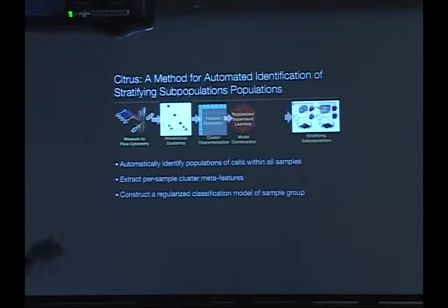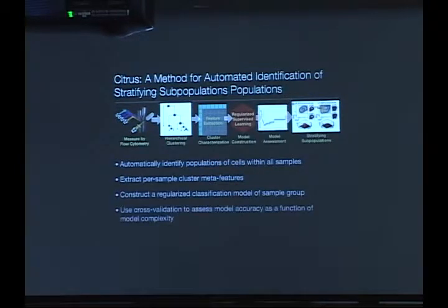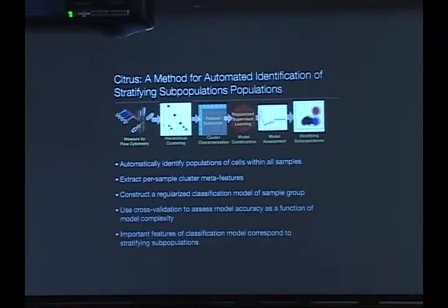It'll say, you gave me 100 cell subsets. I'm telling you that these two are the ones whose abundance differs between your healthy and diseased patients. And so we can evaluate this model using some cross-validation techniques. But really what it comes down to is if the model can find something that's strongly associated with your endpoint of interest, those are in fact the cell subsets that you're interested in finding in the first place.